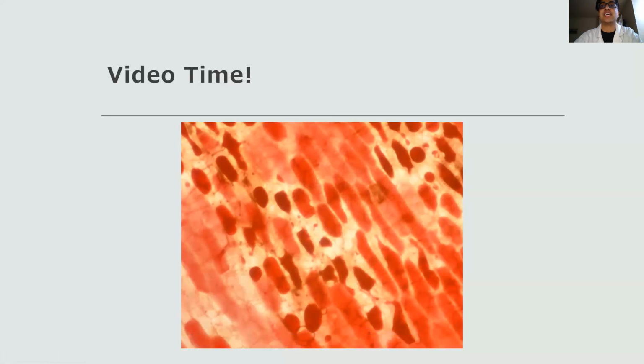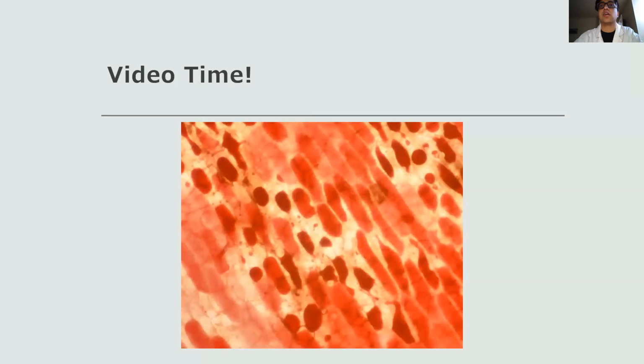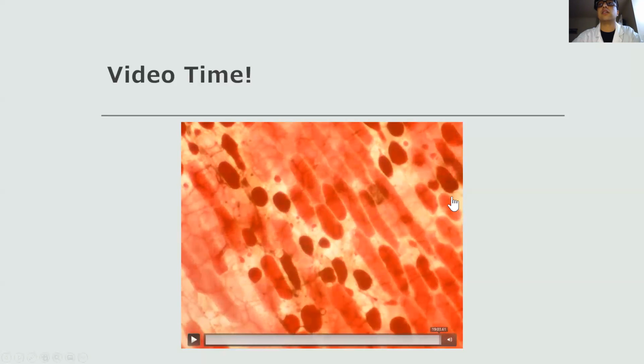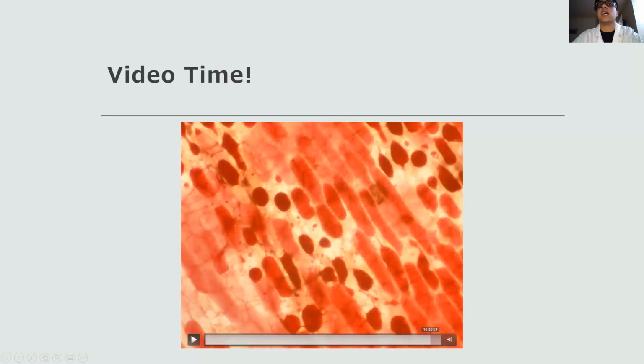Apologies. The slide kind of moved, but if you can just recalibrate and fix your slide under the microscope, you should be good. But now essentially what you can see is these shriveled cells kind of go back and normalize in size. Look at this one. Look at up top. You can see that they kind of normalize. Look at this one on the right, on the very right. Look at how it becomes normal back in size. And also look at these round ones.